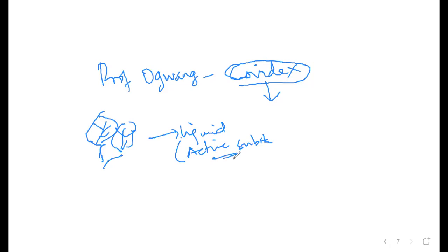So to extract this active substance, I don't know whether it was immiscible with water or miscible, but one of the procedures that can be used to get that component is steam distillation, if you want it in its pure form. So some of these principles are applied in pharmacy, pharmacology, and other procedures.